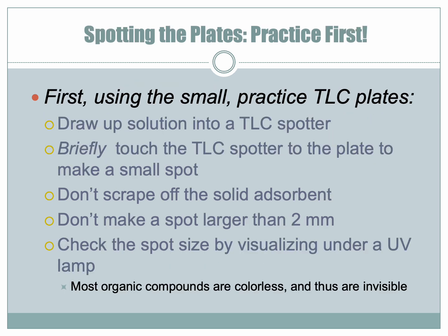So you should practice spotting the plate before you do it on your big plate. TLC plates aren't cheap, so it's very easy to ruin them. So before we actually do the real deal on our real plates, we should use little scraps of TLC plate to practice, to make sure that we're making our spot as small as possible. So the tinier the spot, the better the resolution that we'll get. They'll be able to separate the components easier if the spot is smaller.